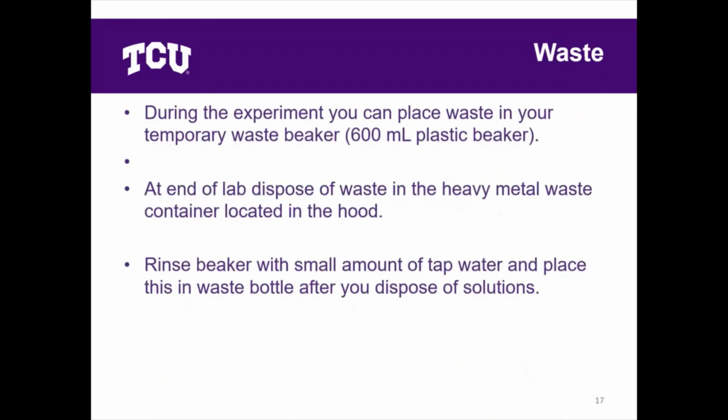For waste, during the experiment, you can place any waste you have in your temporary waste beaker, your 600 mL plastic beaker. Please don't use glass beakers for your waste beakers. At the end of lab, dispose of the waste in a heavy metal waste container located in the hood. Rinse the beaker with a small amount of tap water and place this in the waste bottle after you dispose of solutions, and after that, everything can be rinsed in the sink as normal.